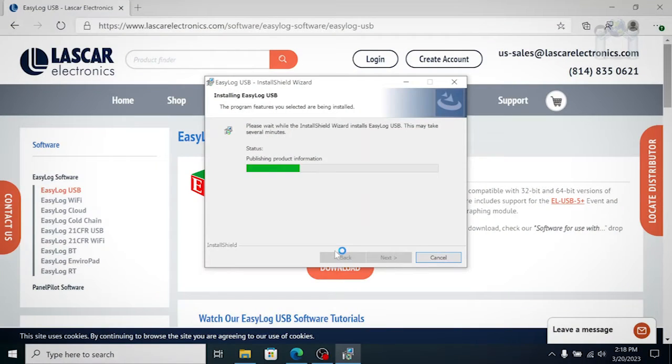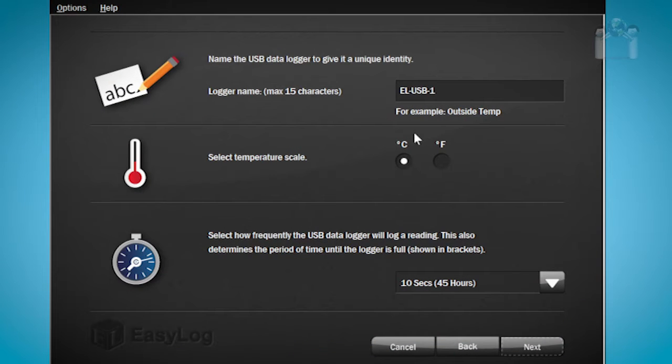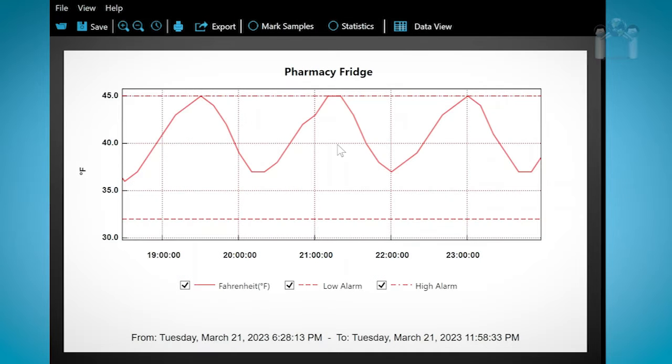Now, let me demonstrate how to install the EZ-Log software. This software is necessary for you to use your data logger. It is used to configure the logger, download the data, read the data, as well as perform other functions.